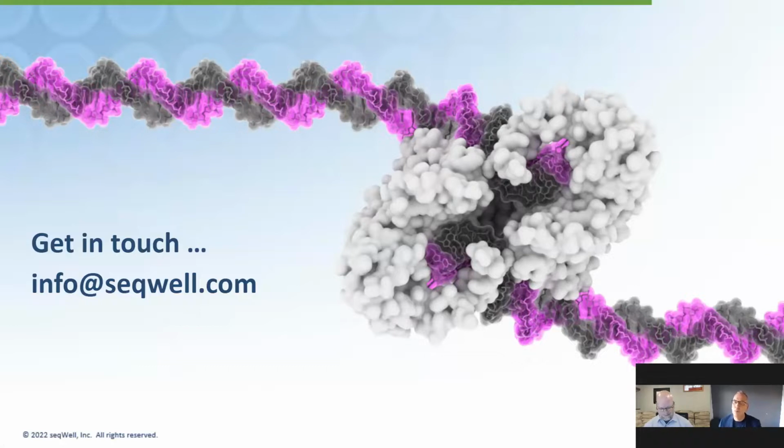We have another question here for Joe. How do you see tagmentation, or TN5, working with those who want to do expression, RNA-seq or single cell?